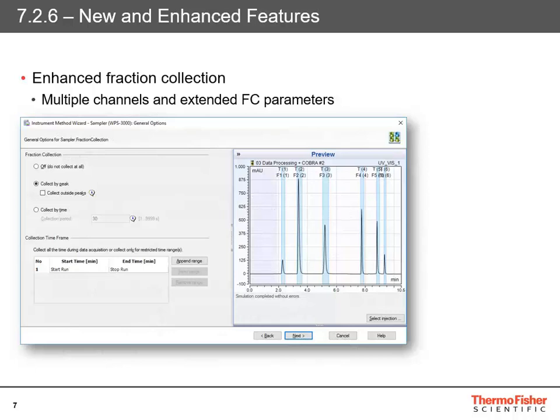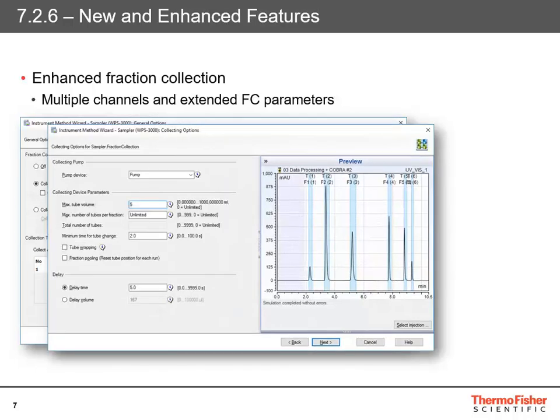On the left-hand side we're collecting by peak. On the right-hand side it's showing you exactly which peaks are going to be collected, which tubes they'll be in, and which fraction they're part of. The next step of the wizard sets things like maximum tube volumes and delay time — the time it takes from the peak to get from your flow cell to the point where it drips out into your collection vial. Those also affect the number of fractions per tube, and that would update in the preview if a fraction went over two tubes.